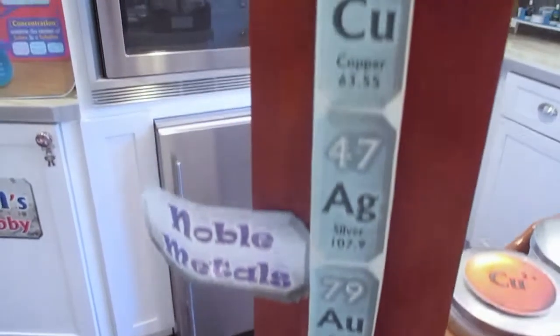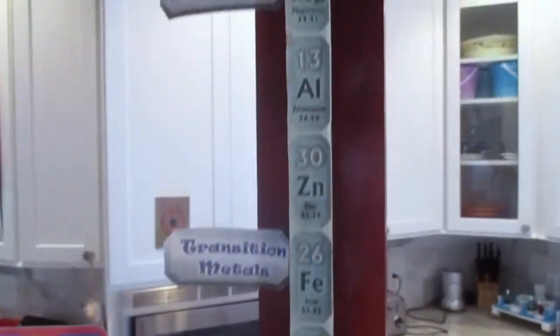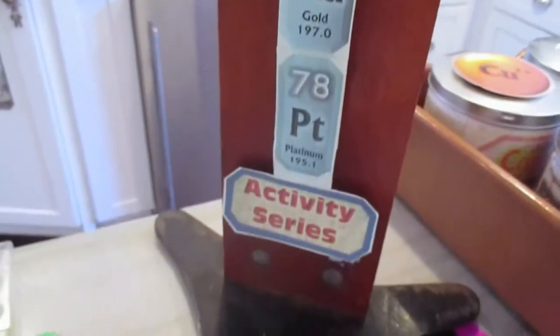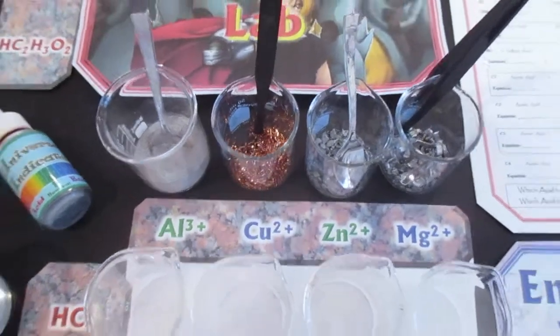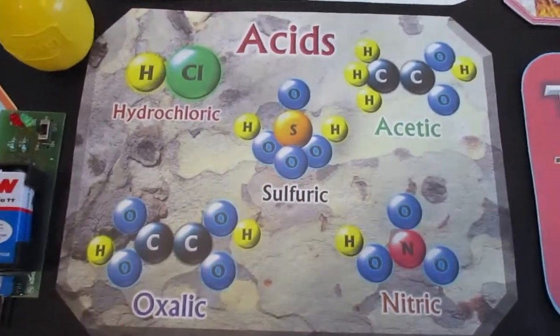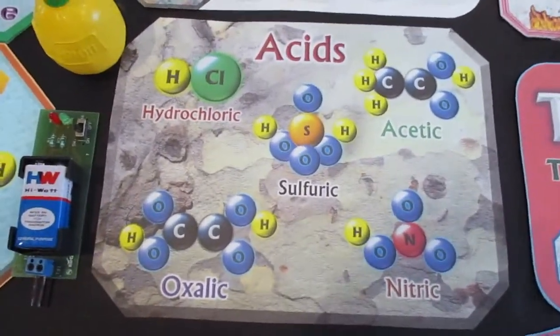At least if a metal is above hydrogen, all of those should react with an acid. All the ones above hydrogen, but not necessarily those ones down there. Maybe we have one of those so-called noble metals in here, but otherwise we would expect to get a reaction with a metal. That's what acids are supposed to do. Well, really, they don't.